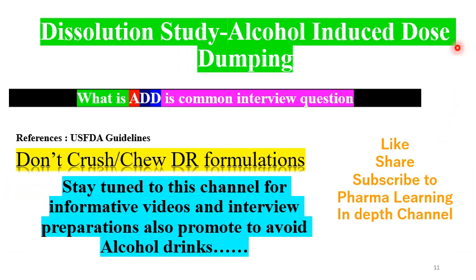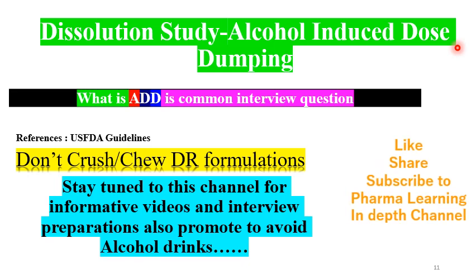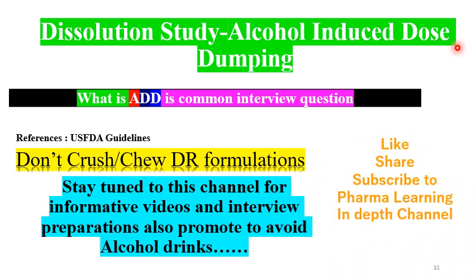Now you might be clear why these formulations are tested for alcohol induced dose dumping. Mainly, the dose dumping study is required so that the formulation is proved to have a delayed release profile, and the delayed release profile or the formulation design is maintained in the alcoholic media. For this video I have referred to the USFDA guidelines and the product specific guidances available.